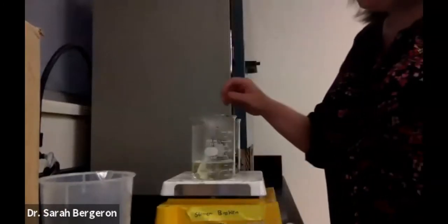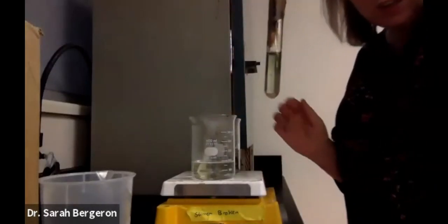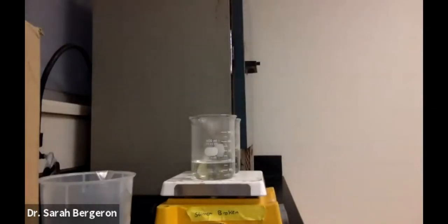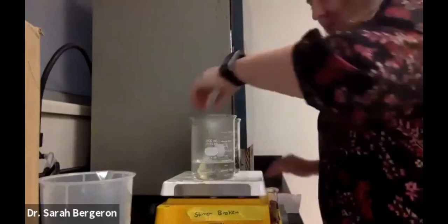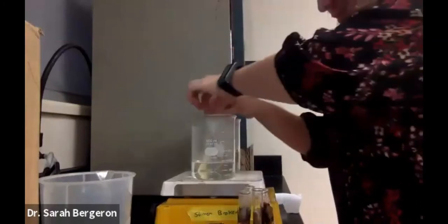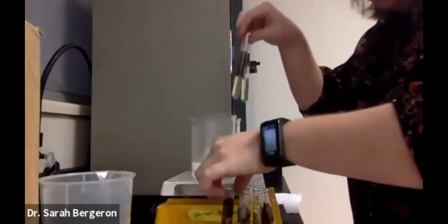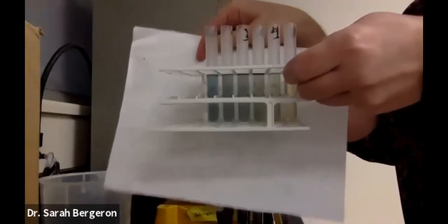I have to find a white sheet of paper. So let me take these out. Oh, and look, here you can see if I can find a white sheet. Here we go. Here you can see that there's a gradient of color. So what we need to do is vortex that again. We're going to take all these samples out and vortex them. Let's see if I hold this up for you with the white sheet behind it. Can you see now that there's a gradient of color? It's kind of yellow, 0, all the way over here to blue with the most standard in it.